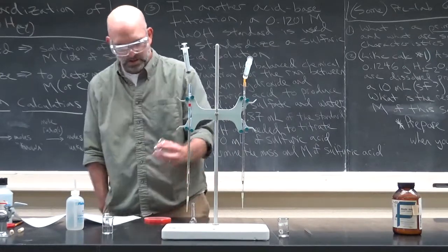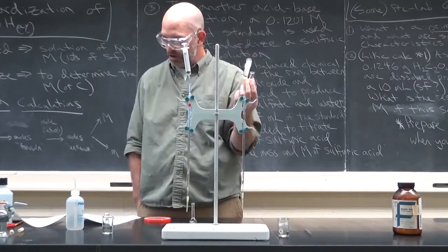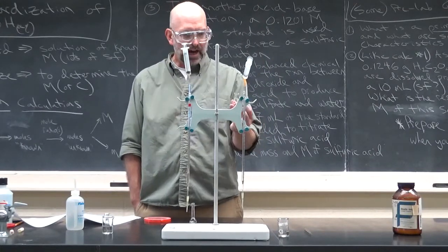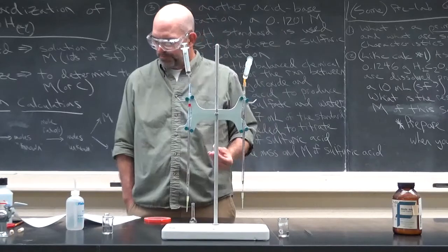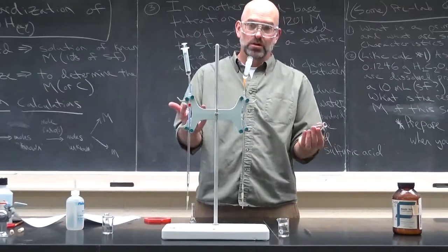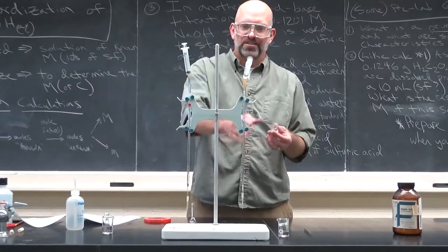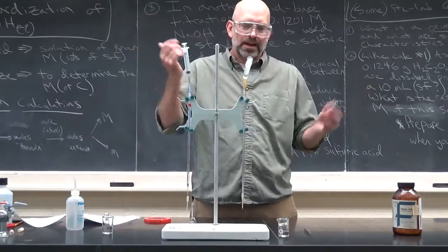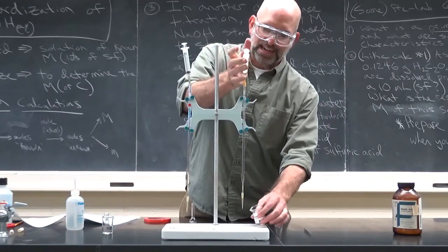So we're going to take one milliliter of oxalic acid, dispense it into an Erlenmeyer flask. It doesn't say what size, but I would use the 10 mil because you're not talking about big volumes here. So, and we'll talk about running a data table later. So actually, what you're going to want to do for each trial, you'll want to record the initial volume on the burette because you can just keep pushing more out.